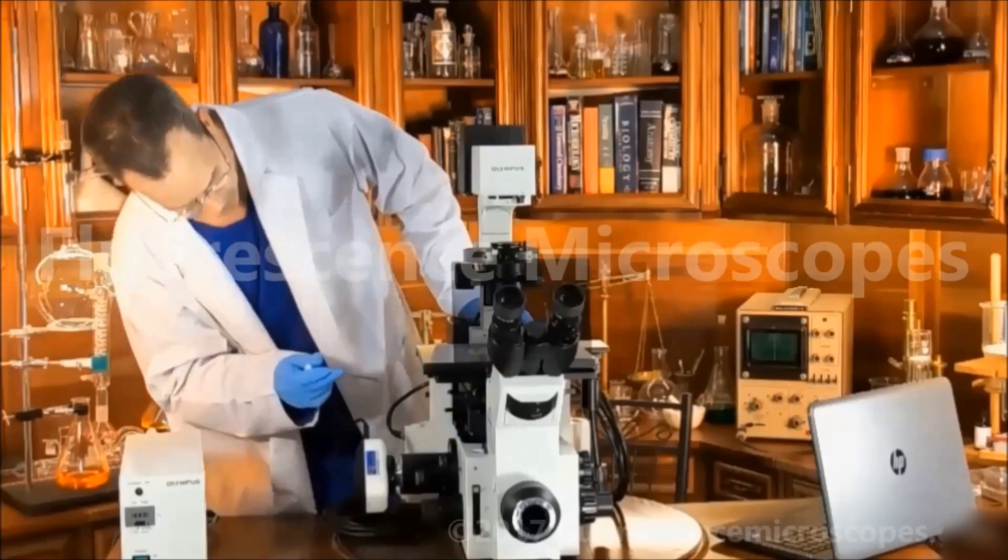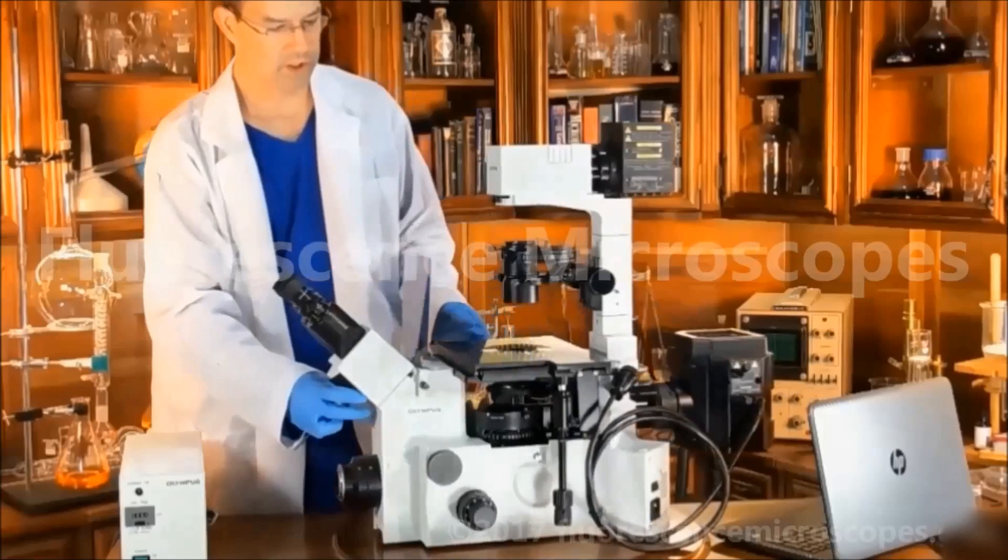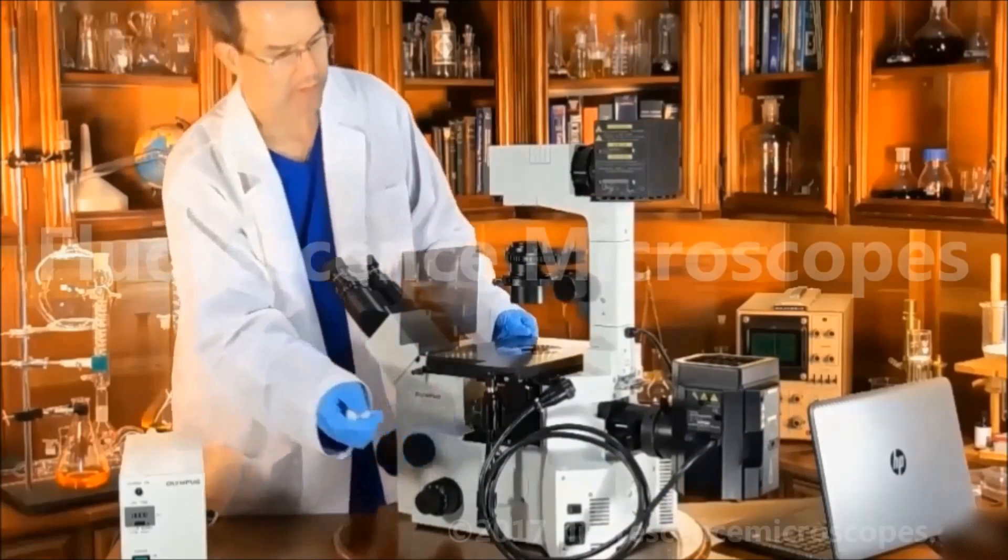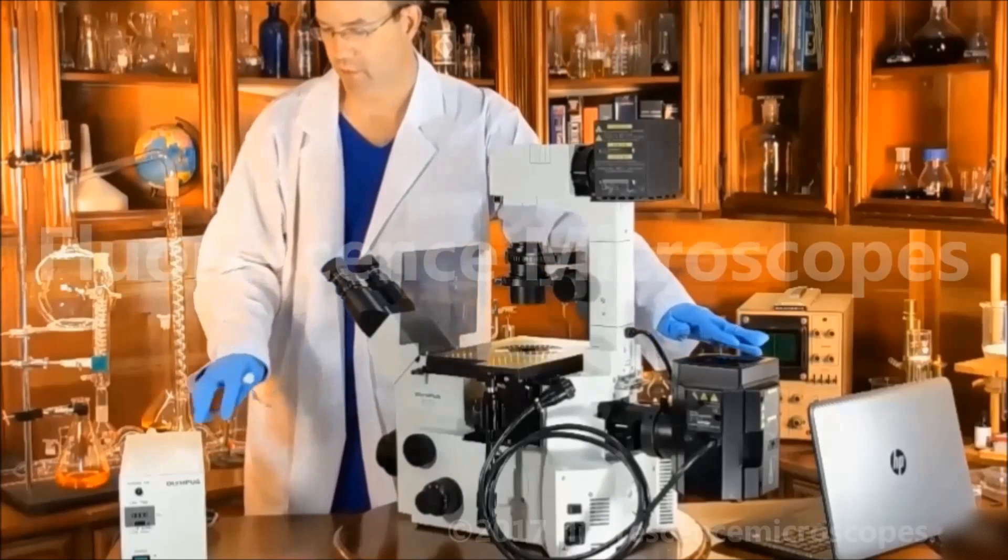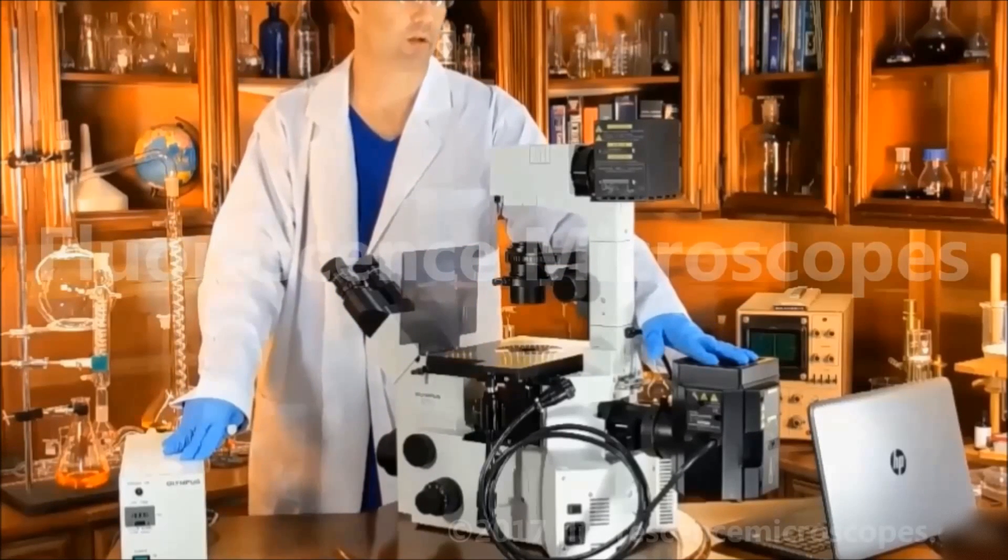If you need any custom configuration on this microscope, please let us know. We can change objectives, filter cubes. If you want a different lamp housing, if you want to use like a metal halide X-Site system, we can hook that up to the back.